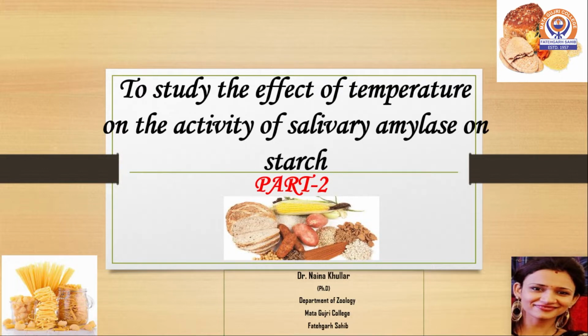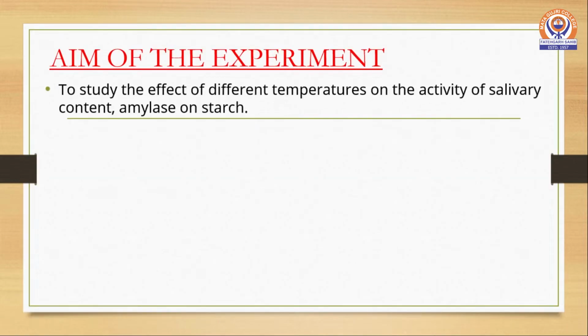I welcome you to the practical video lecture series on study of the effect of temperature on activity of salivary amylase on starch, part 2. The aim of this experiment would be to study the effect of different temperatures on the activity of salivary content, that is, amylase or ptyalin on starch.